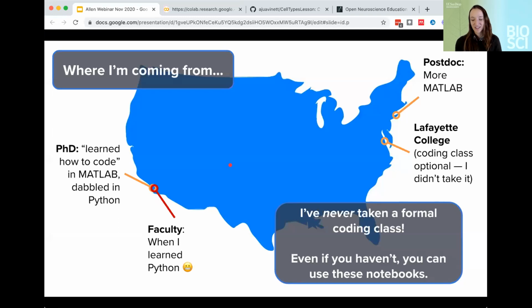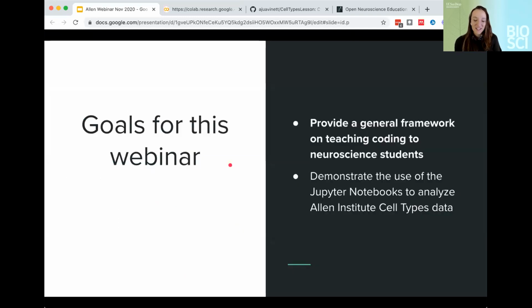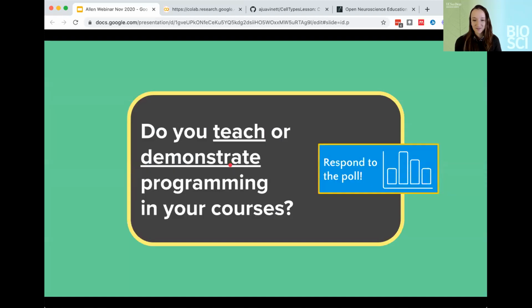So first bit of inspiration for you this morning. The first thing I want to do in this webinar is to provide a general framework for how you can actually teach coding in your class, which sounds like for many of you is a neuroscience class or a biology class. And then what I want to do is actually demonstrate the use of Jupyter notebooks to analyze some of the data that Tom just told us about. So we're going to do an interactive demonstration. Hopefully you came ready to code this morning.